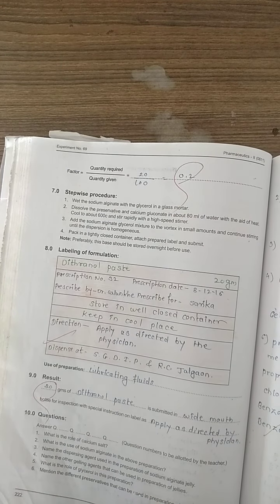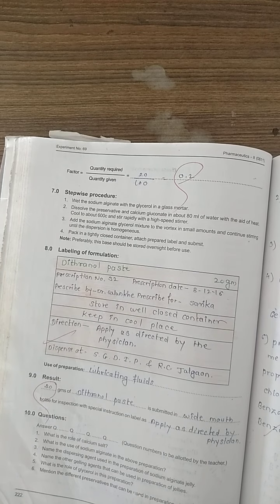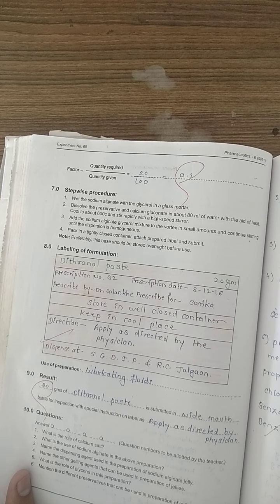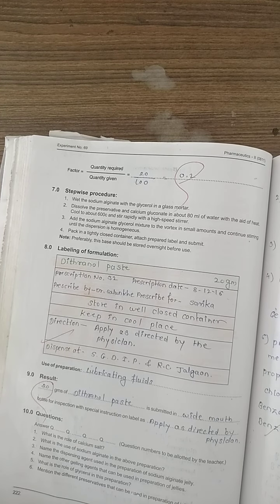Experiment number 69 — here you have to write jelly. This is a printing mistake in the manual so correct it. The jelly is used for its demulcent action, local anesthetic properties, and antiseptic properties. Result: 20 grams of jelly is submitted in a wide-mouthed bottle for inspection with special instruction on label as applied as directed by physician. Experiment number 69 ends here.